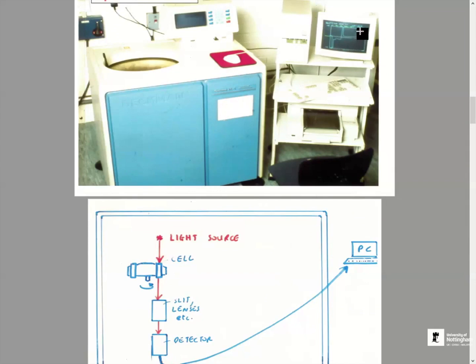And looking at this curve here, this looks like a steady state sedimentation equilibrium experiment. So the operator is wanting to measure molecular weight. Yeah, absolutely. You can see from the age of this computer here that this photograph was taken a long time ago.